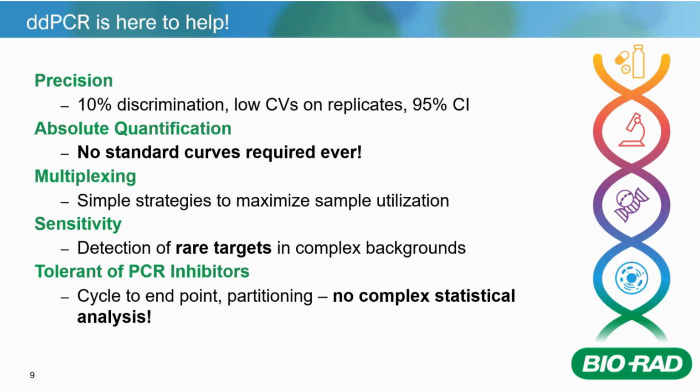So in some droplets, yes, there's an inhibitor present and it causes those 1, 2, 5, 6, 7, 8, 100 droplets to fail, but it doesn't cause your whole reaction to fail, because those inhibitors have been sort of titrated out, I would say. So because of this, you've got way less impact of inhibitors as well.